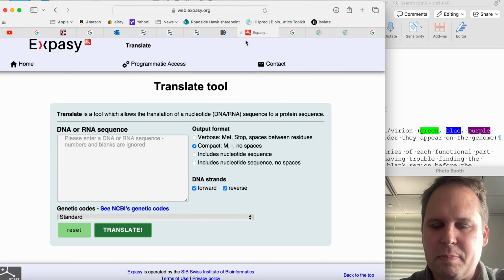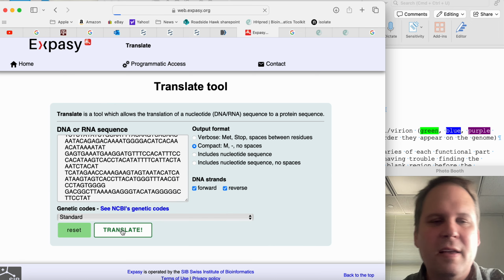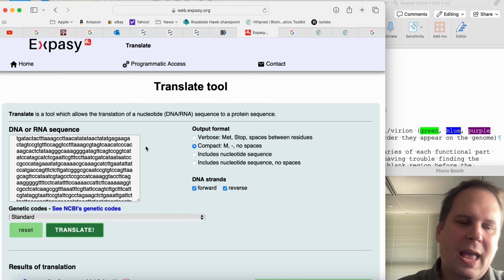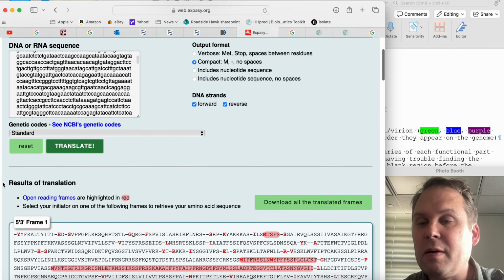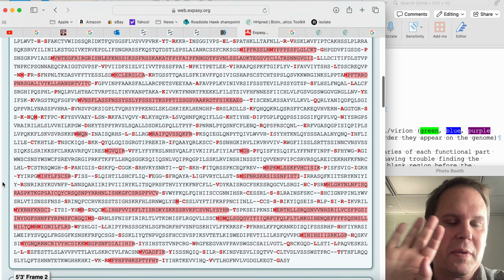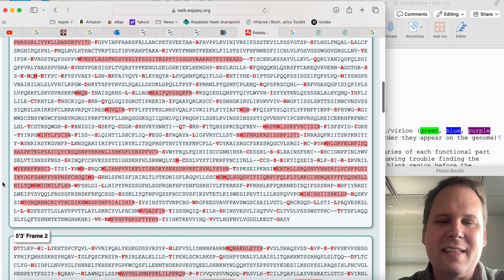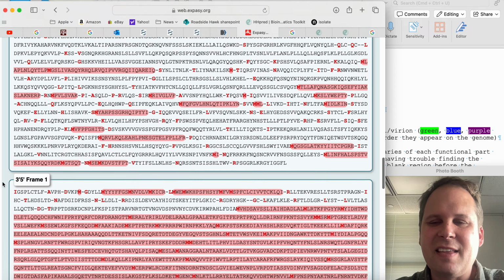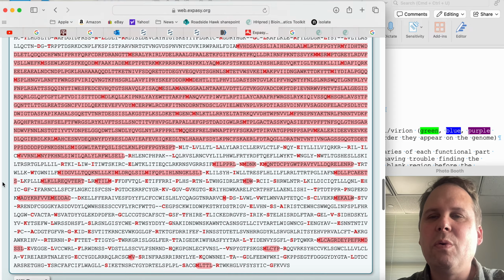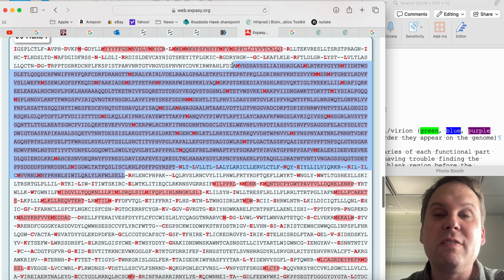We are going to put it into something like Expasy Translate here, paste it all in there, translate it up, and we're looking for an improbable thing. We're looking for a very long protein, because we know that when we're looking at just junk, there will be starts, there will be stops, and it'll just look like this. It'll look like a hash. Just nothing, nothing, nothing. And then, oh, look at that. We'll have some of these big proteins. You might have one giant protein.